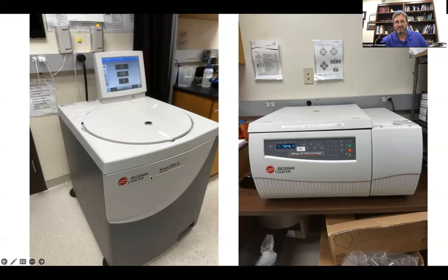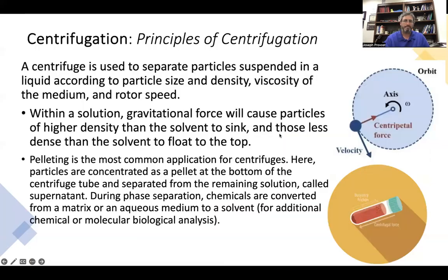These centrifuges can have fixed angled rotors, where it's a metal rotor where the angles of the tubes or the bottles stay fixed throughout the speed. You can have swinging bucket rotors where you put tubes or bottles inside a bucket that's on a pinion that will swing out as the rotor starts to turn. Both of these can have both. Here at USD, we only have a swinging bucket rotor in our Allegra, but they can be fit in other places when you move on with fixed angle rotors. So it's kind of rotors, bucket, swinging bucket rotor, or a fixed angle rotor can go in either kind, super speed, tabletop, or slow speed.